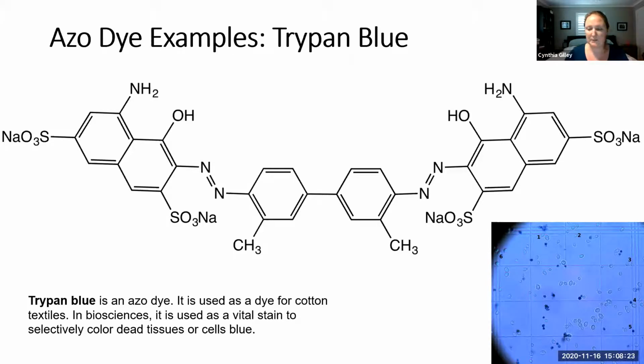So for example, using a microscope, you can prepare a slide of the cells and then count up the number of cells you can see in a number of squares. So notice that the dye gets into cells that have a cell membrane that is permeable because it's lysed or it's dead. Okay, so they're able to count the live cells here, and then these blue ones are the dead cells.